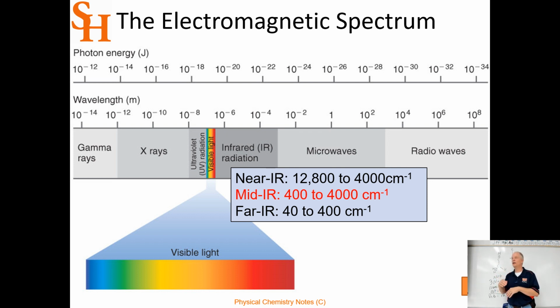So if we put protons in a strong magnetic field, we can get this energy difference, and then the radio frequencies can cause that jump to occur. And so that's where radio frequencies really come into play in NMR. So nuclear magnetic resonance: the magnetic field sets up a difference in energy based on nuclear spin, and we can only get that difference to be in the radio frequency.